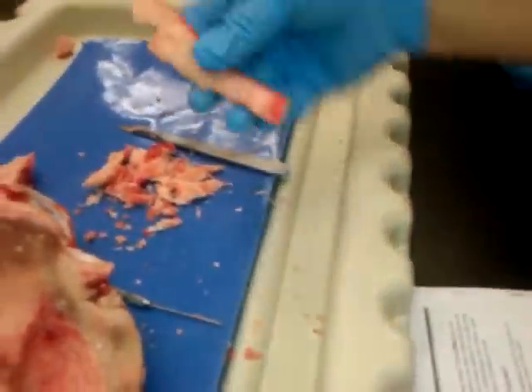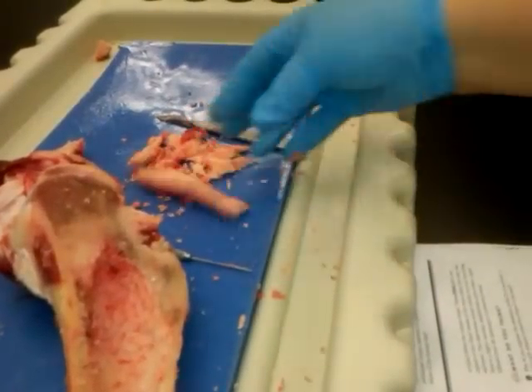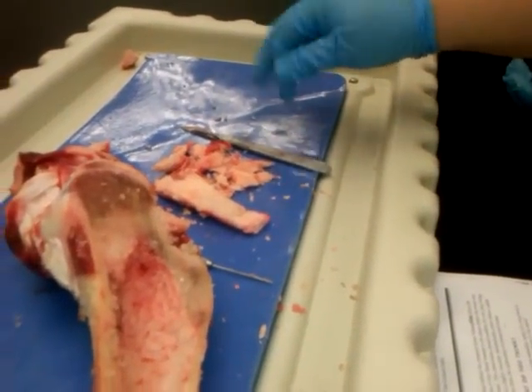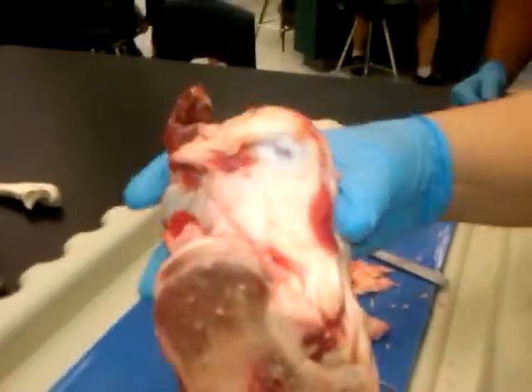That stuff is your yellow bone marrow. Oh, that's right — check it out. What's it taste like? I'm not eating this. And this is supposed to be a tendon, I guess.